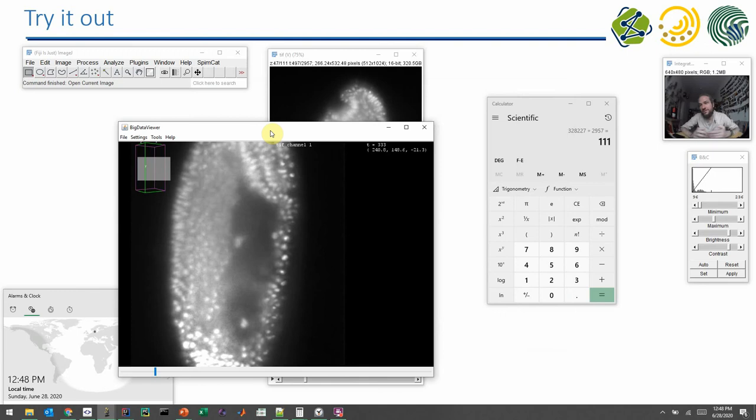Again, we are looking here at a 300 gigabyte dataset on a laptop with 16 gigabytes of memory. And this all comes just with Fiji. You don't have to download additional plugins. This comes with Fiji and you can already study embryo development.